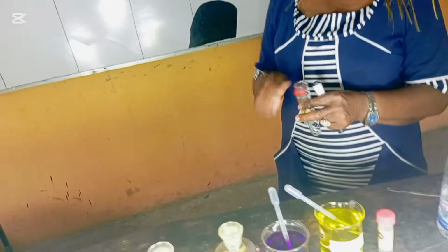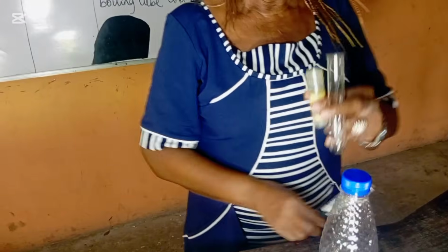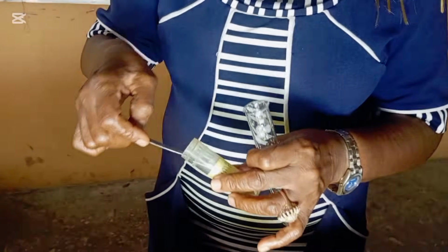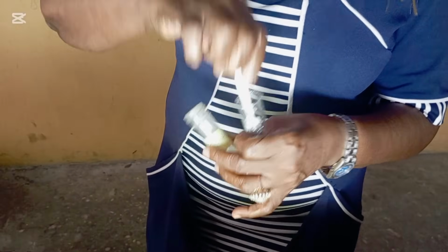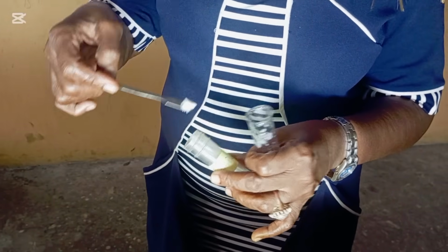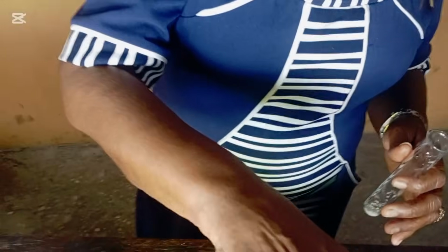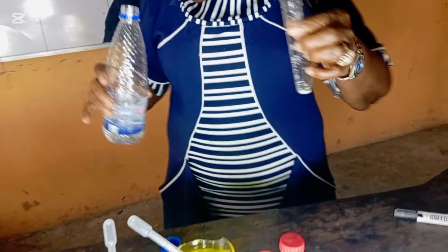That's my test tube. So I'll take half of C and put it in the test tube as instructed. You cover it. That's distilled water, about 10 cm cube.